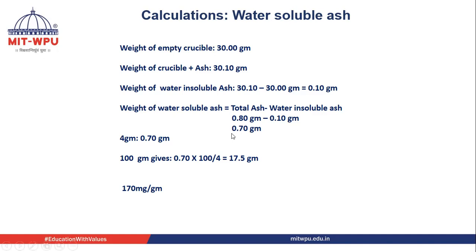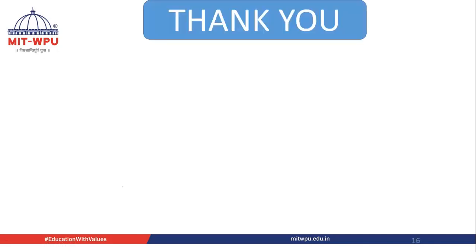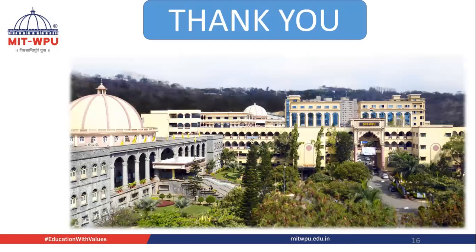So by this way, we can determine the total ash value, acid insoluble ash value, and water soluble ash value.